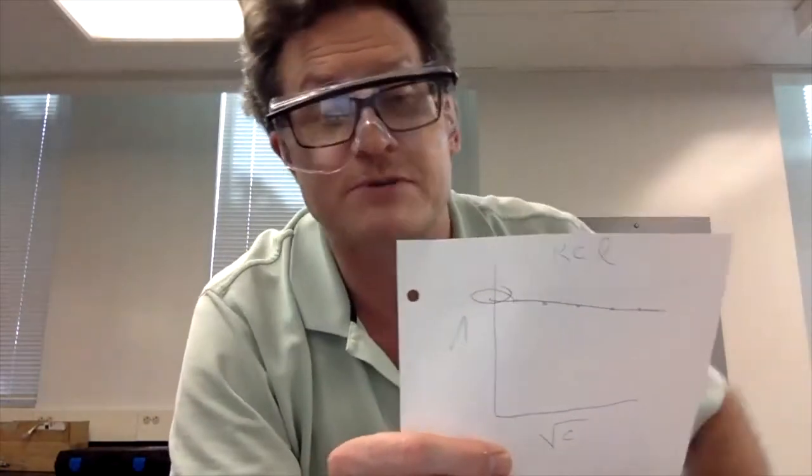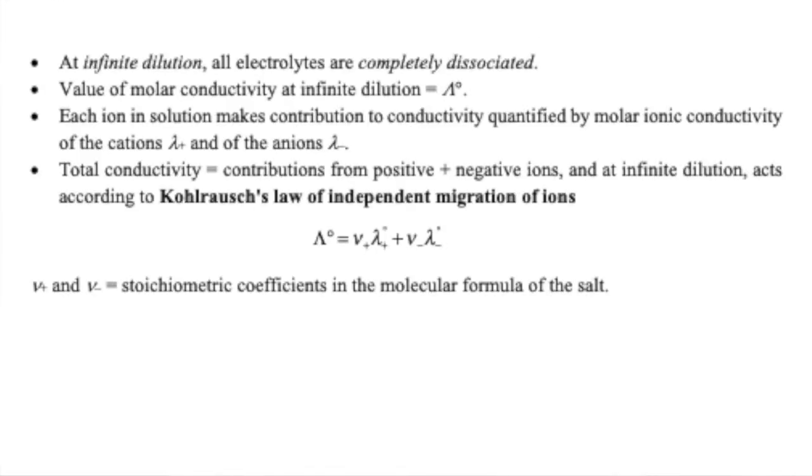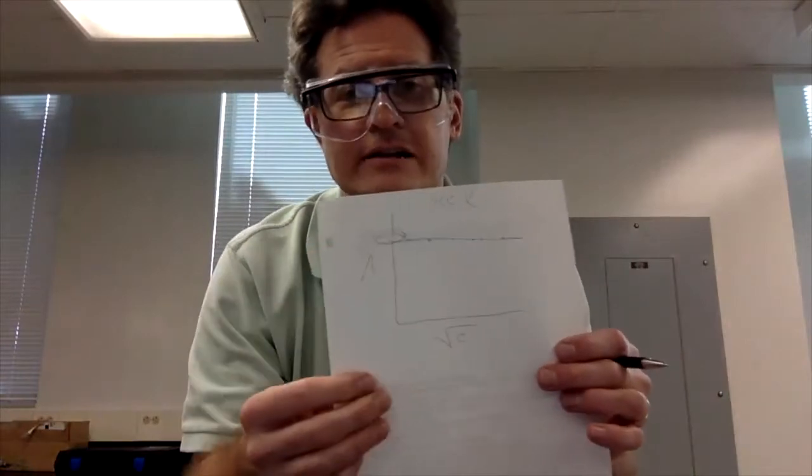And we're going to measure the intercept. And the intercept is going to give us, from the molar conductivity, the limiting molar conductivity. Limiting as in the limit of infinite dilution, right? Okay. It's okay to do an intercept like that. This is a really flat line anyway, right?